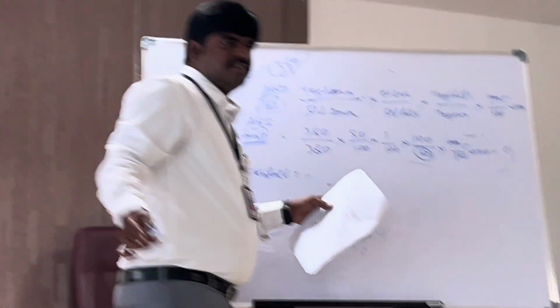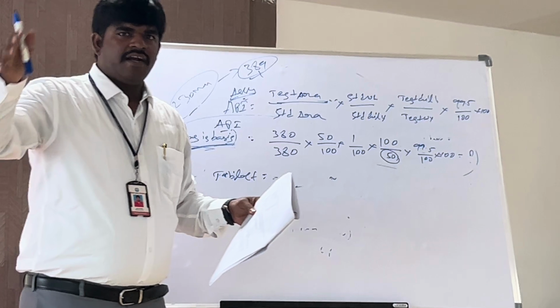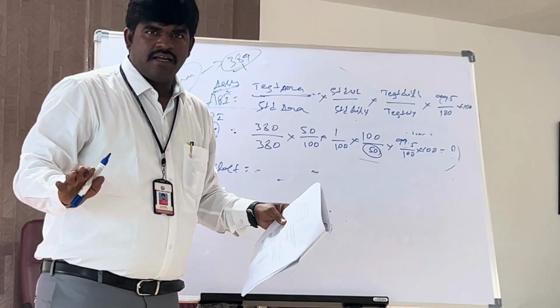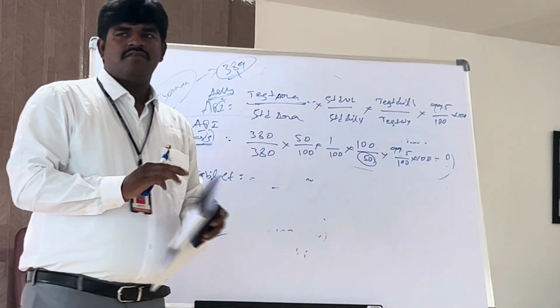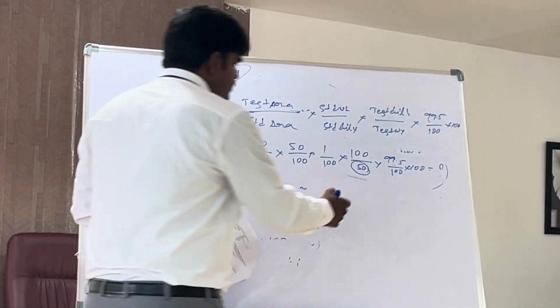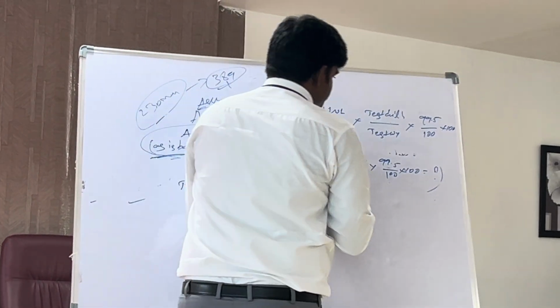Here, sometimes the test weight is a dropping method. For example, you drop 10 tablets directly into the volumetric flask, pour the diluent and mix it. In those cases, average weight is not required. But if you are taking the powder, in those cases you require the average weight.